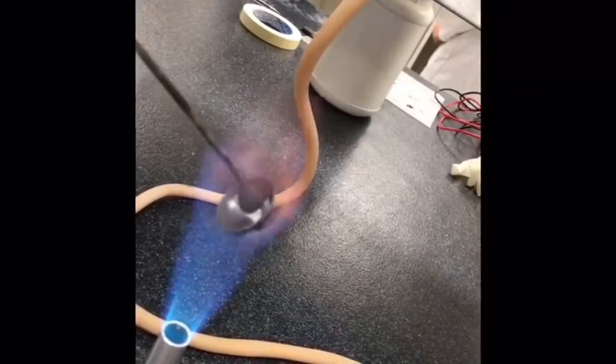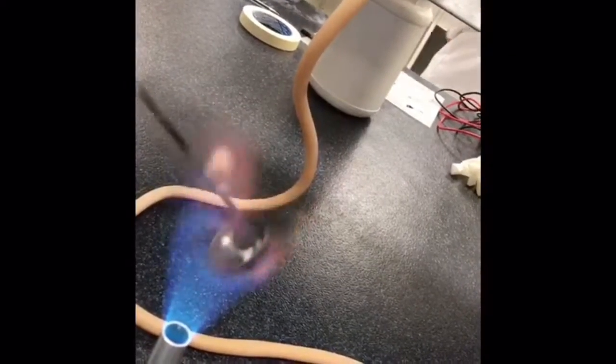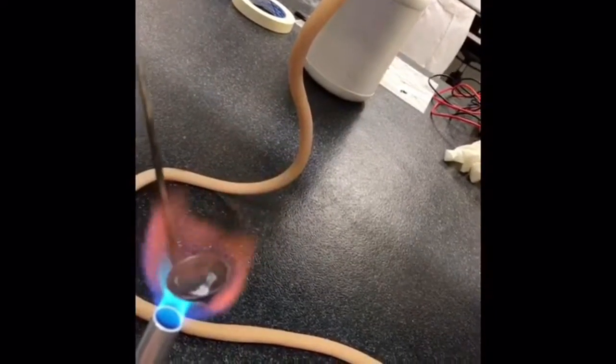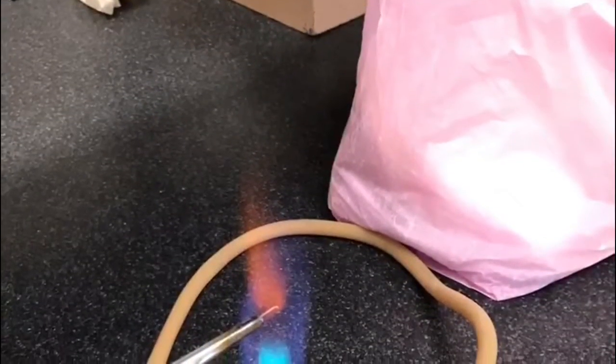When we burned the iron for the rapid oxidation, we used iron in dust, and we didn't see any change at all while burning it. But after burning it, we noted an important change. It became a solid and bigger part of iron, and it stopped being just dust.